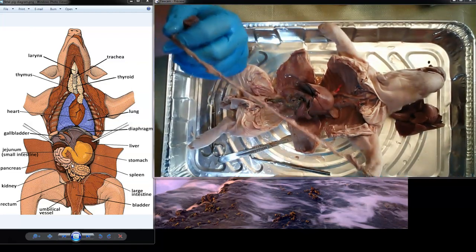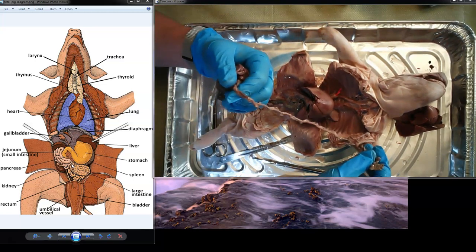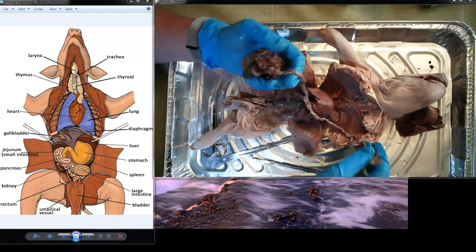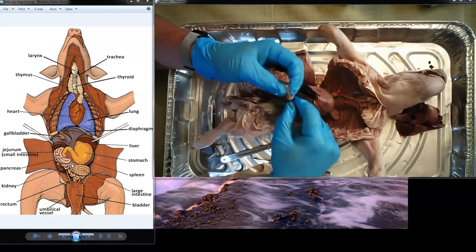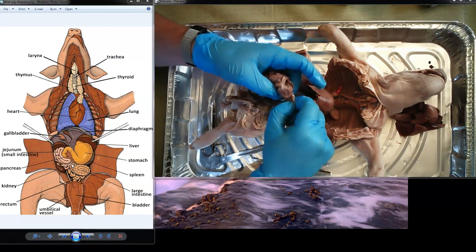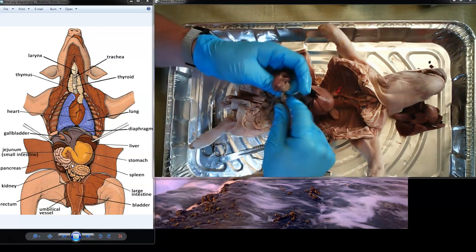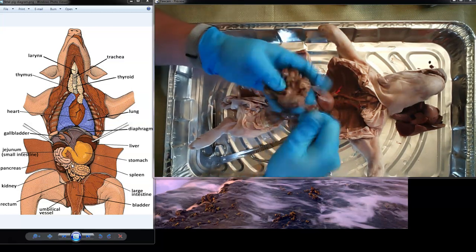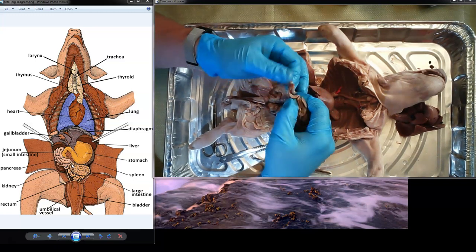So the small intestine in you is in the neighborhood of 25 to 30 feet. So we're talking maybe 10 meters or so. That's how much intestine you have in you. And it's that long because the intestine is responsible for getting all the good stuff out of your food. And the longer it is, the more chance you have to get the good stuff out of your food. If we didn't eat food where we needed to spend a lot of energy or a lot of work to get the nutrients out, we could have a small intestine and large intestine that were a lot shorter. Carnivores, animals that eat meat, their intestines are not this long. They don't have to be. They can get all the good stuff out of their food with a shorter intestine.